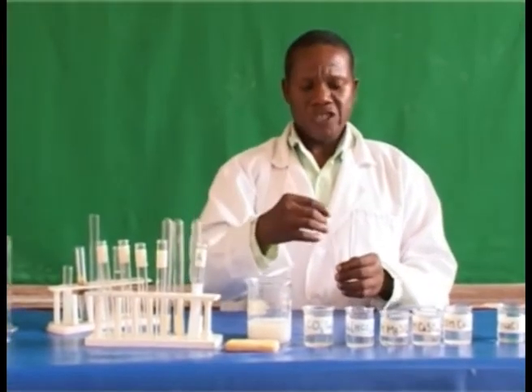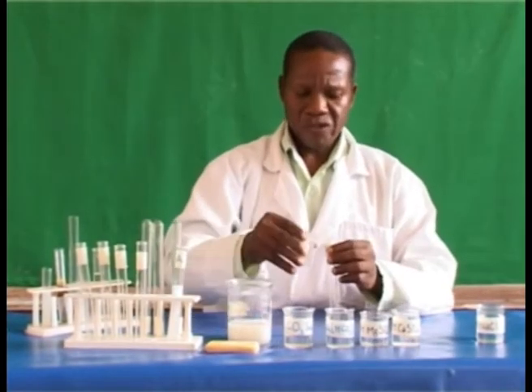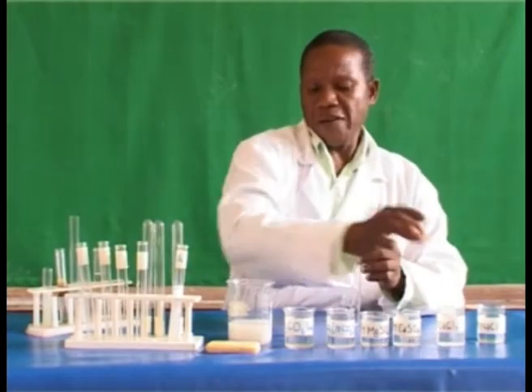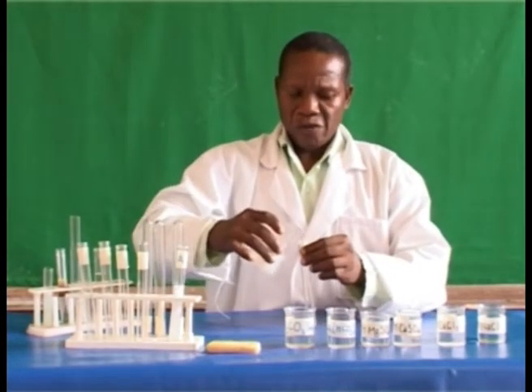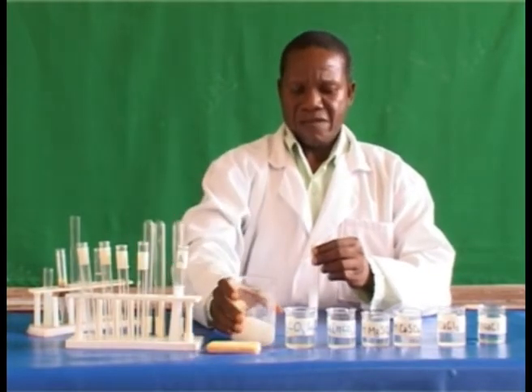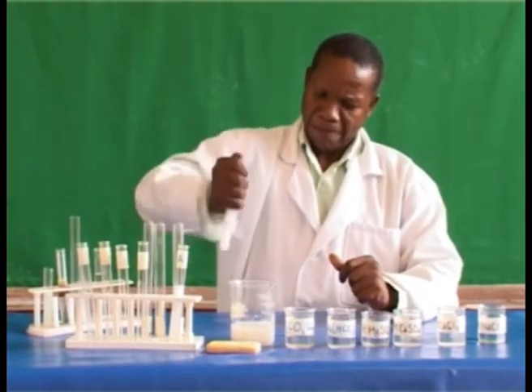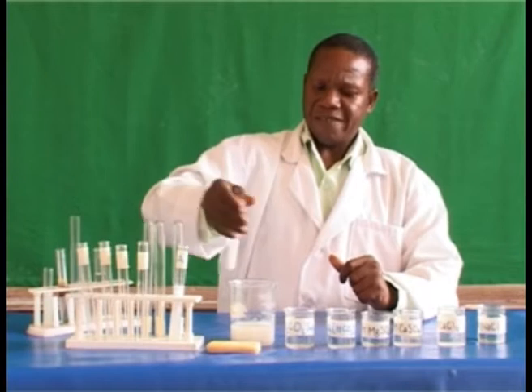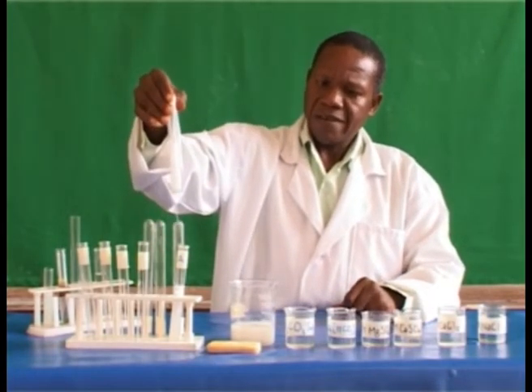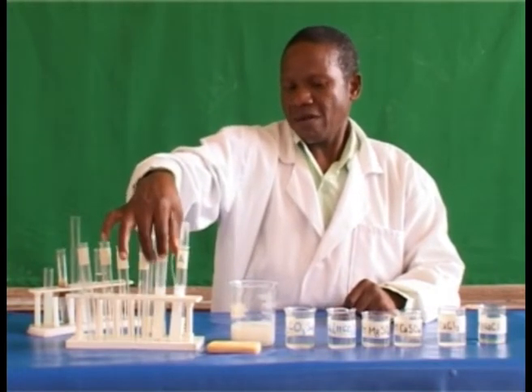Take test tube B, add a small amount of the prepared calcium chloride solution, followed by a small amount of the prepared soap solution, and then check if there is lather formed or not. There is no lather. Now let us put it aside to check what will happen.